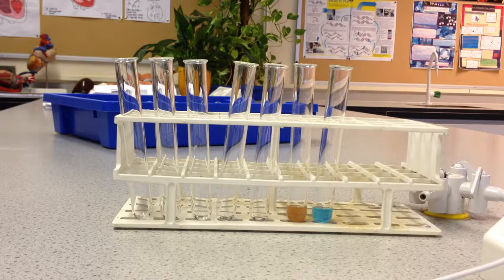However, what if you have a solution whose concentration is unknown? And so the next part of the video we're going to discuss how to determine the concentration, or how to quantify reducing sugars. Okay, so this is useful where if you want to check the progress of a reaction, so you can take solutions out at different times and then check for how much reducing sugar is there. Or if you have one unknown solution and you just want to check how much reducing sugar is in that solution, or its concentration.